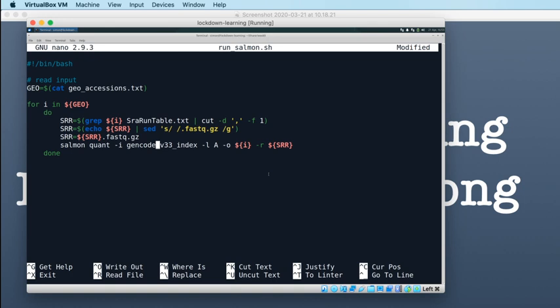So that's the script, and as I said with the file sizes and the SHA-256 sums of the data, which I'll put on GitHub, I will also put this script on GitHub once the lesson is ended. So if you've missed anything I've said, if you've got slightly lost in the last 25 minutes, half an hour, then the script will be available for you to grab a copy of and run before we start to work with this data in R.